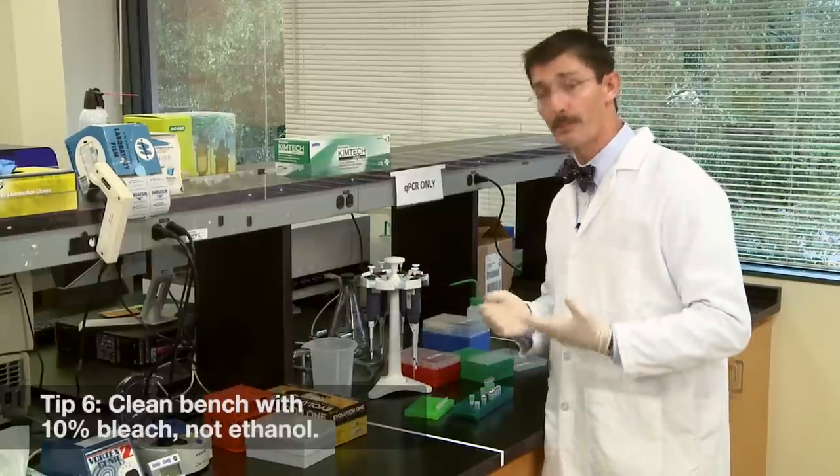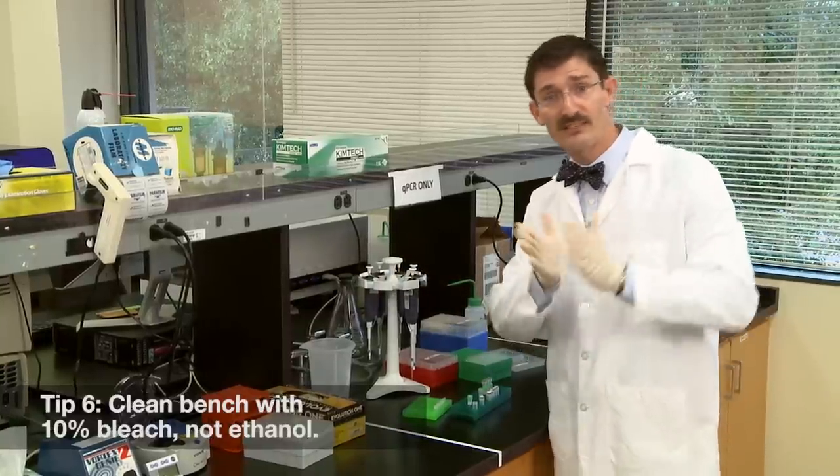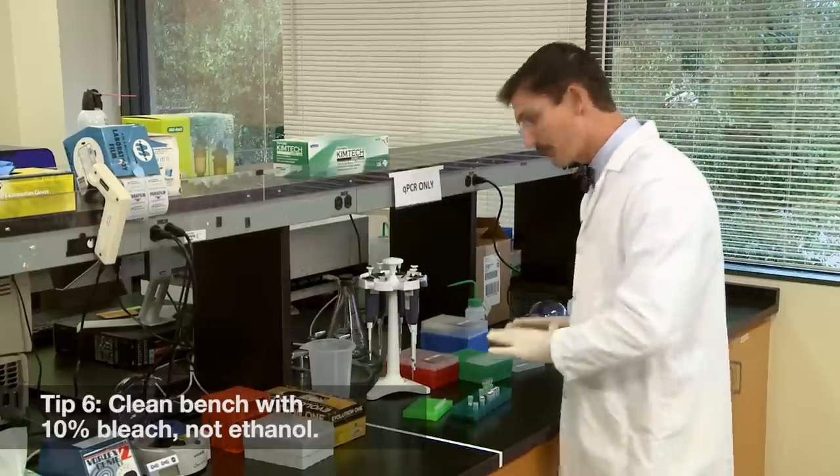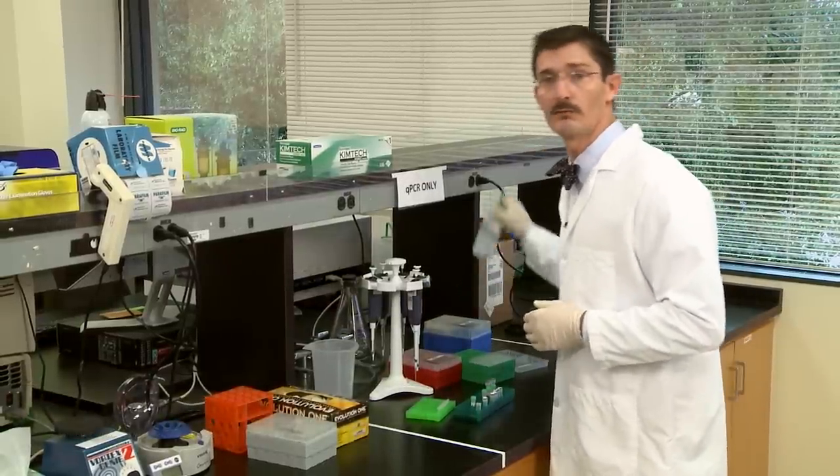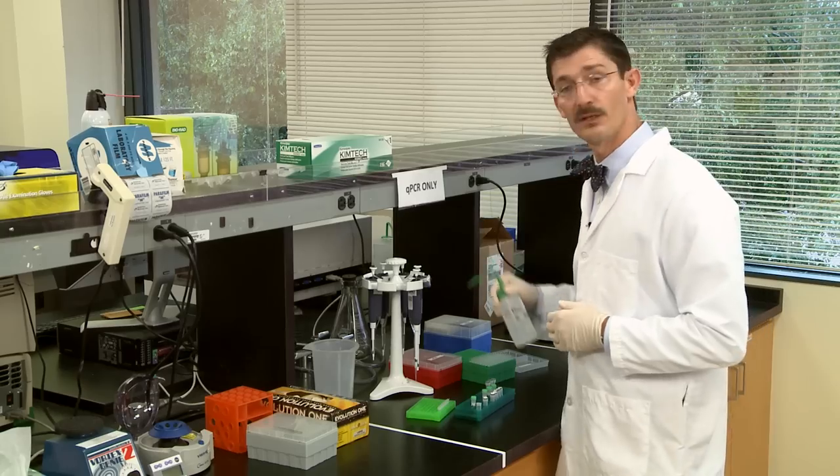Now, number six: you may be used to cleaning your bench with ethanol or isopropanol, but that's actually a really bad idea for qPCR. Ethanol only precipitates the DNA and doesn't remove it. Like your mother told you — use bleach. Ten percent bleach works wonders.